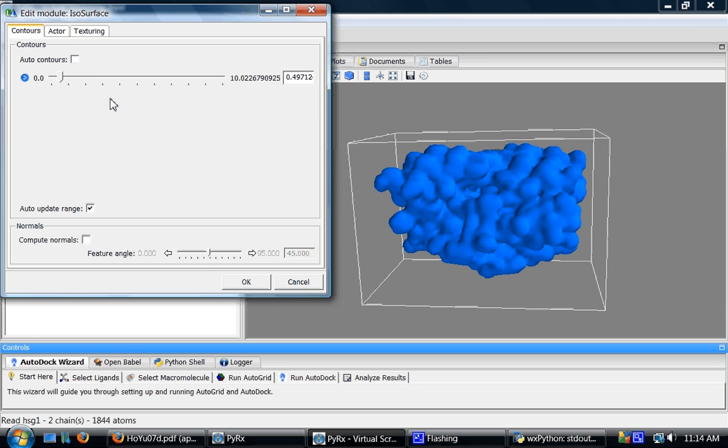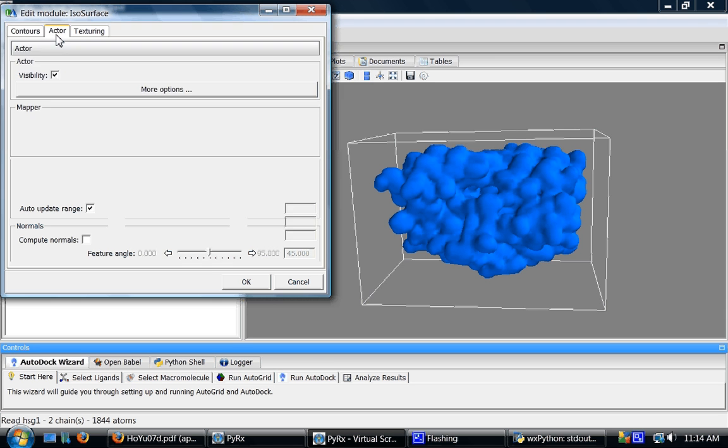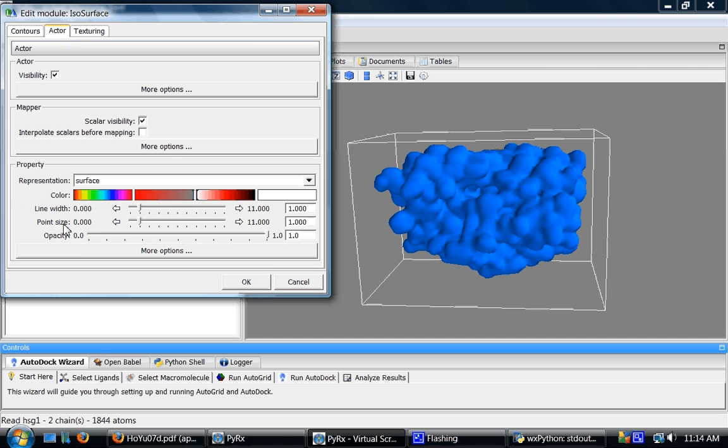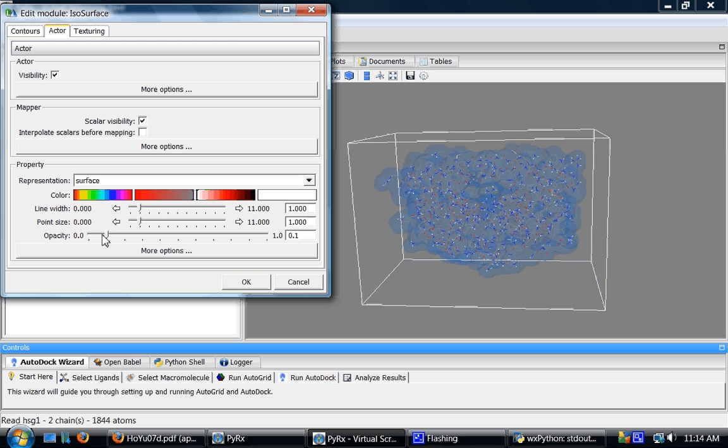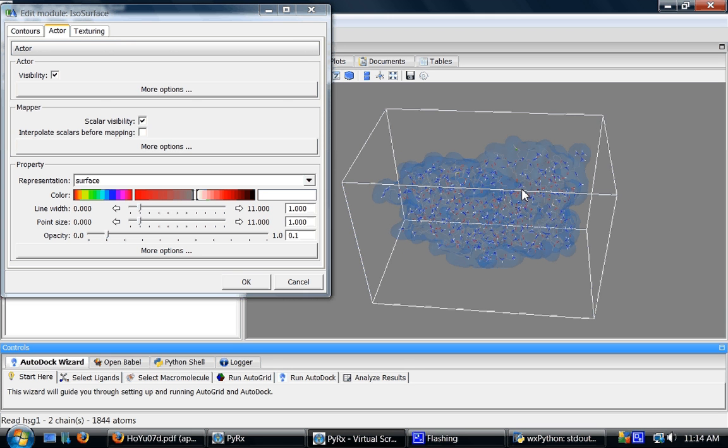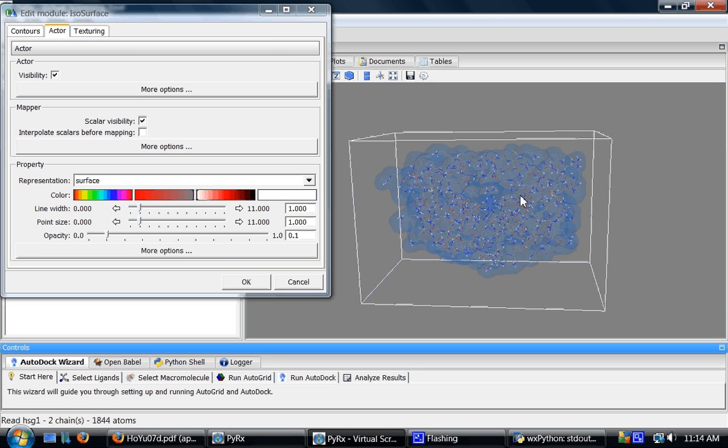Another interesting parameter to play with under actors tab is this opacity slider. You can lower its value and it will make the surface transparent so that you can see atoms underneath this surface.